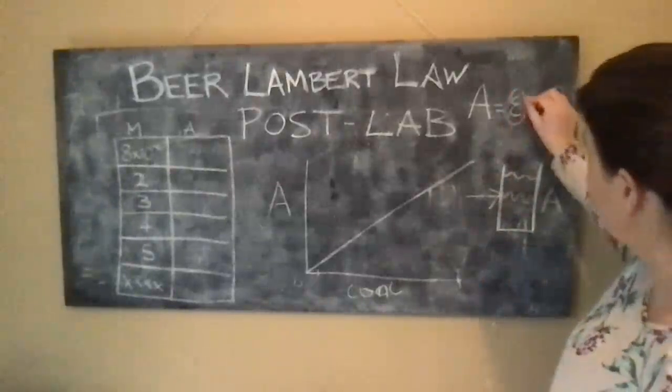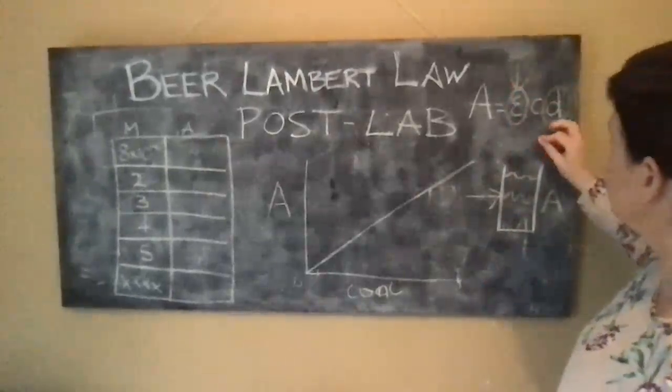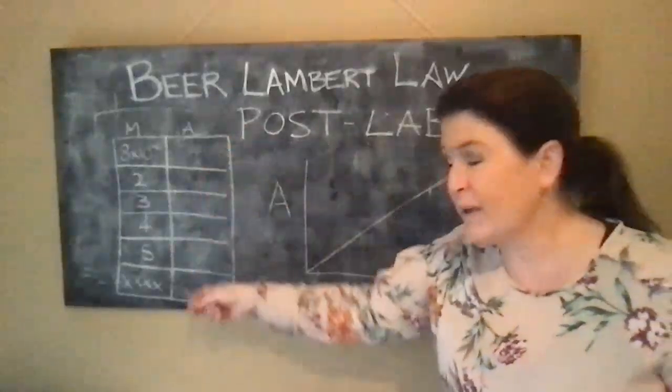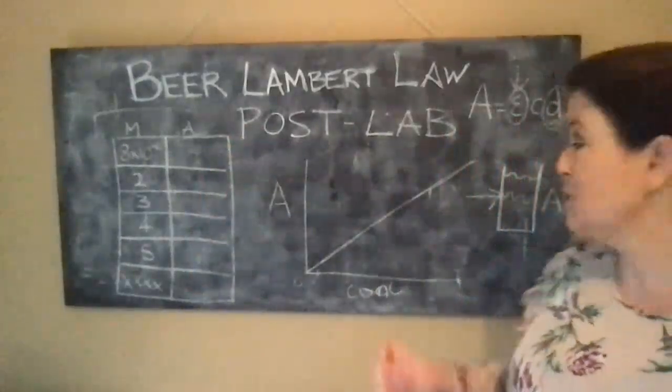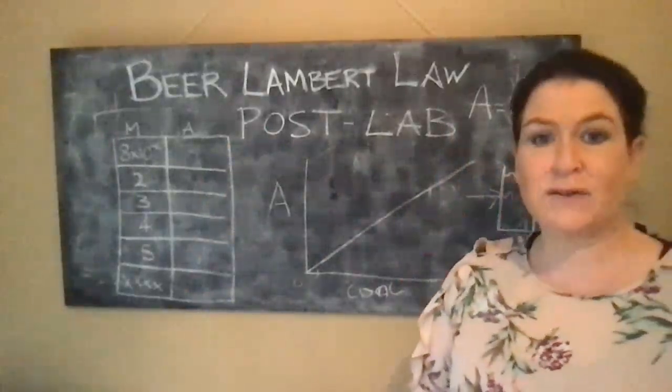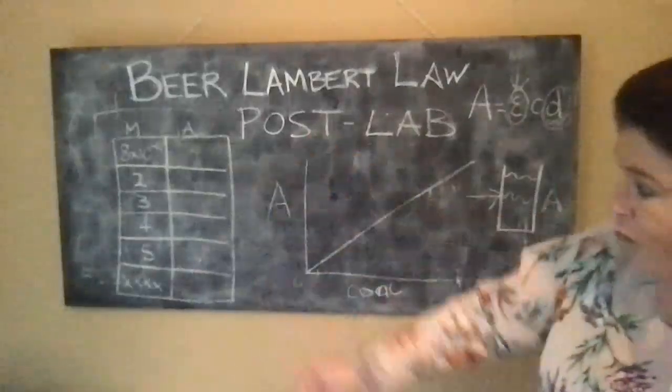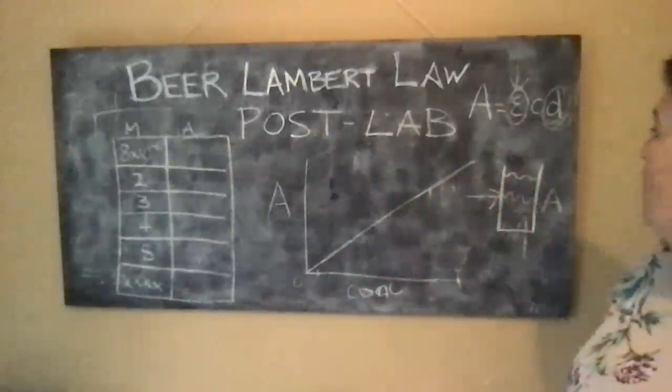So that leaves us with this final species. We don't really need to worry about D, okay? And plus, because we're comparing like with like all the time, because we always are using the same distance or the same pathway, that makes a big difference, okay? In our experiments, the size of the vial is always the same.